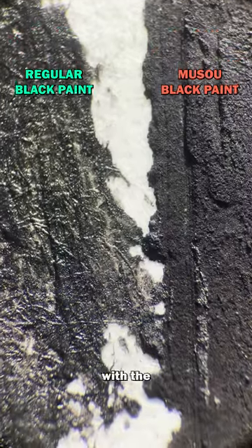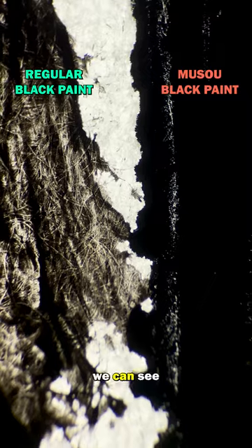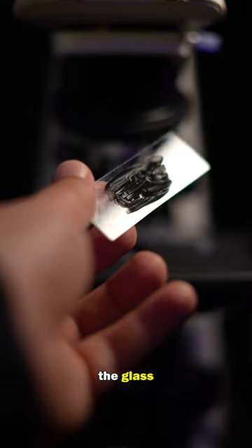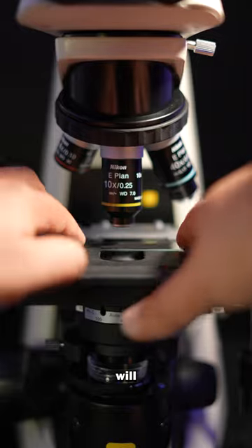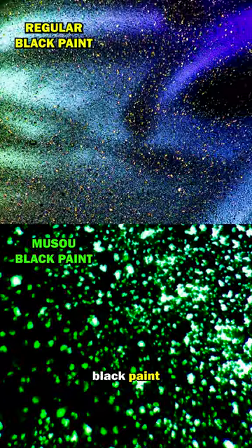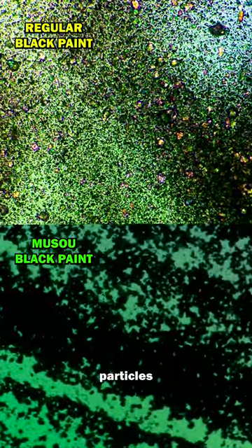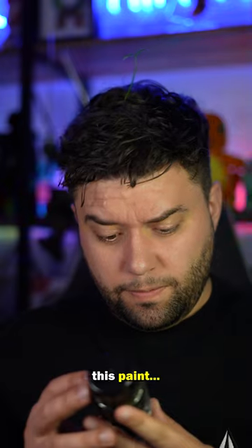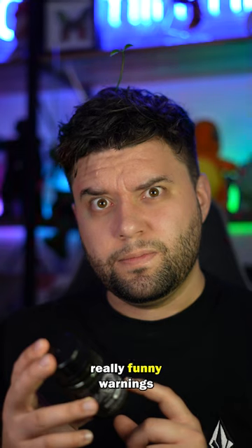Here it is side by side with the acrylic black paint — we can see a huge difference when I shine a light through the paper. I next applied some to the glass slide, and this will blow your mind. The regular black paint up top contains a lot of see-through particles. Musou Black is much more solid, and if you get some of this paint, expect to find some really funny warnings on the container.